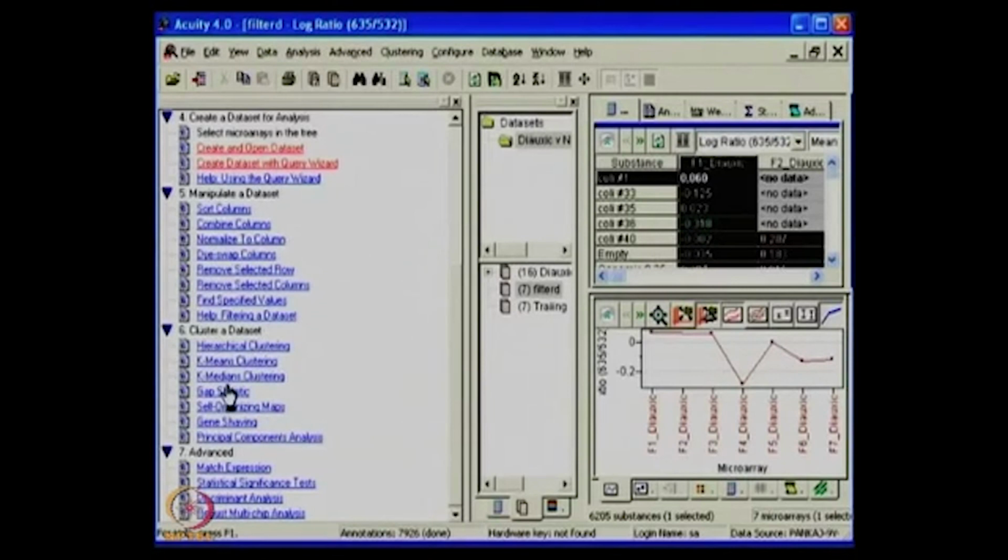So there are k-means, SOMs, k-medians. People particularly use hierarchical when they don't know where to start. They start with hierarchical when they don't know how many groups could happen and how many results I am expecting. And once you have an idea of the results, you can cut down, because hierarchical is a little RAM consuming. It takes a little bit more time, because you can imagine all has to be linked to one.